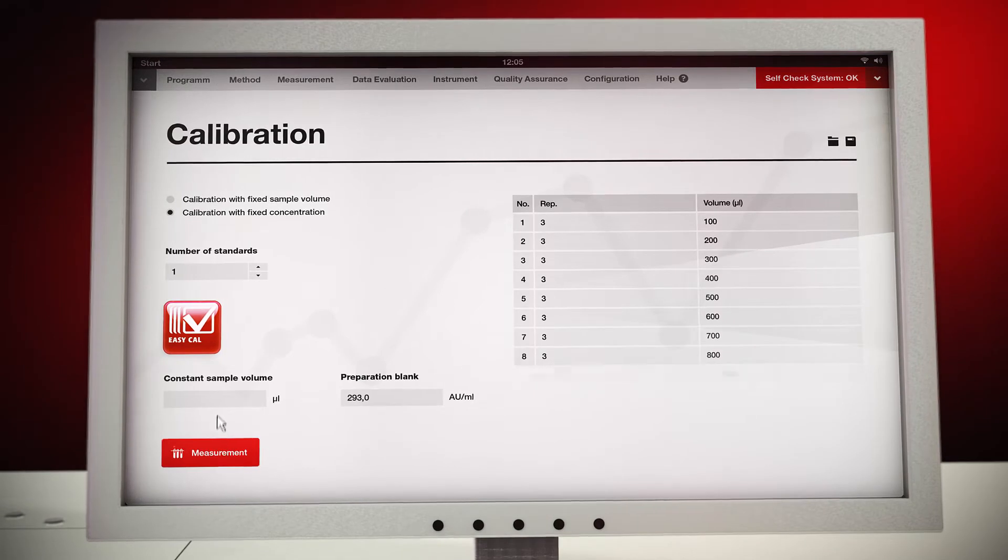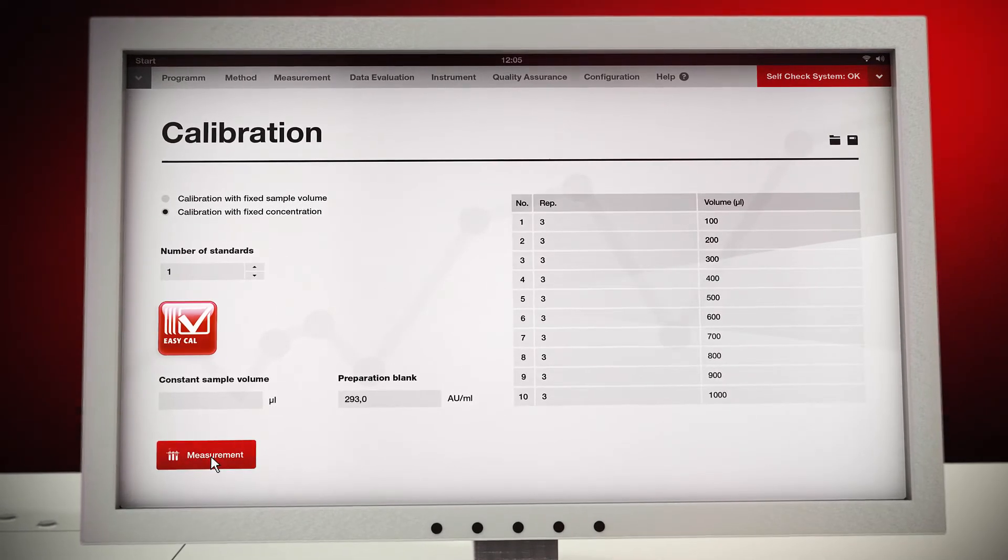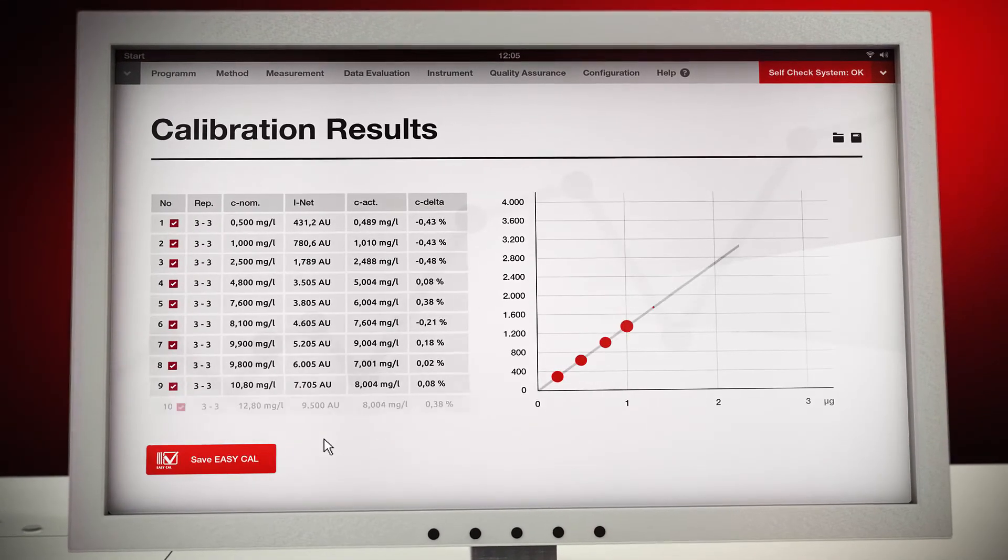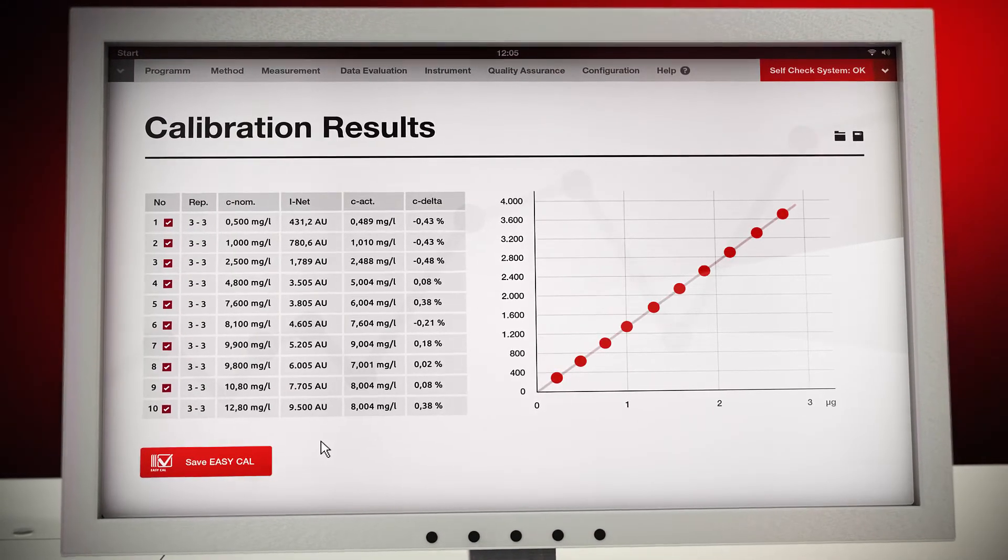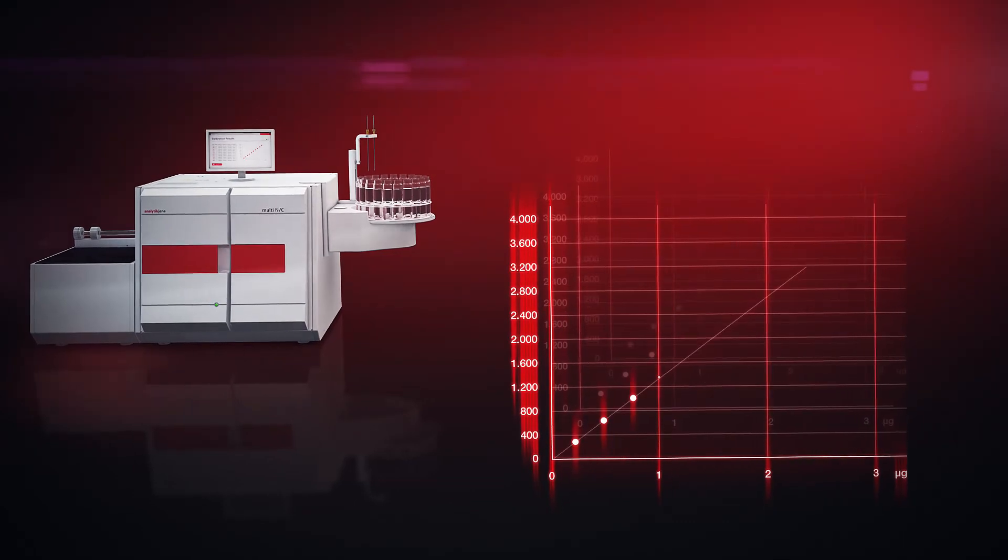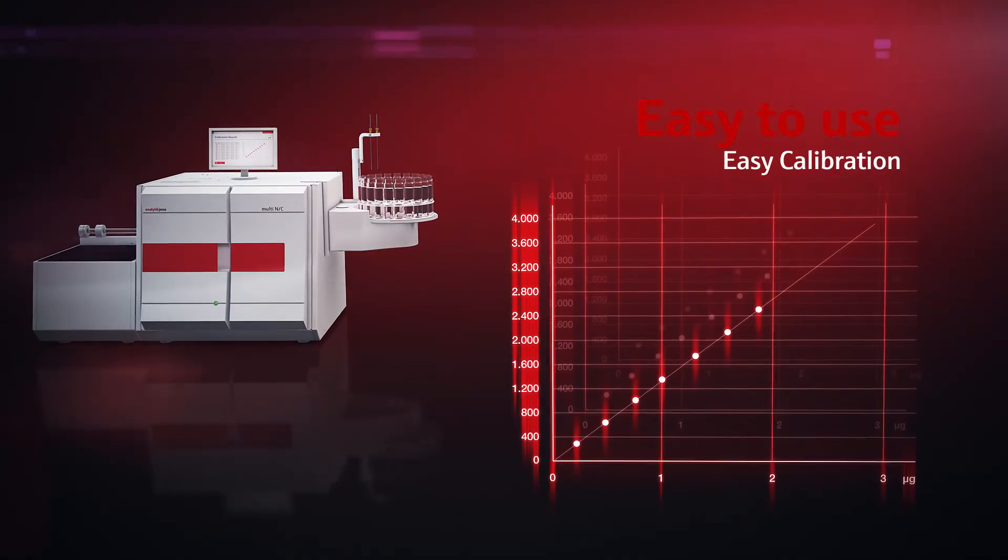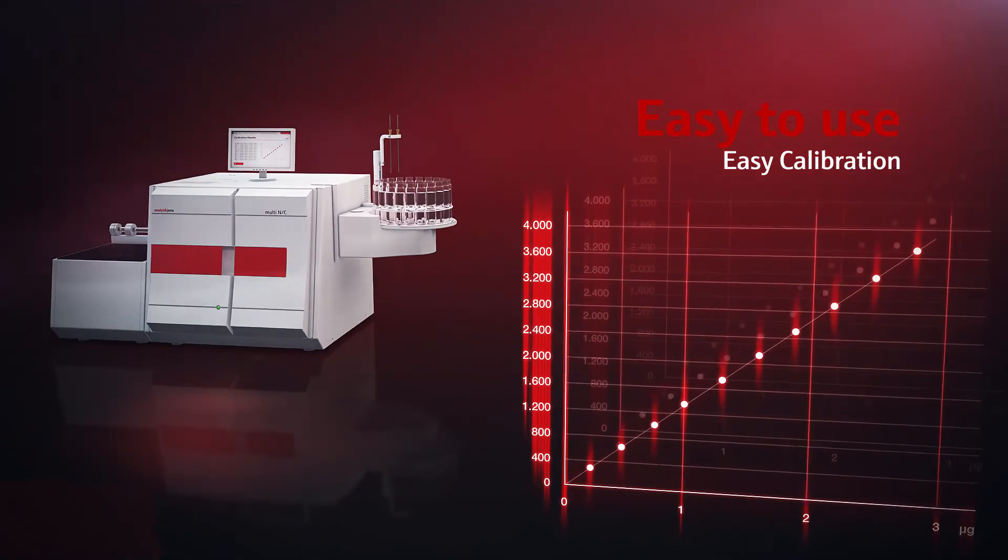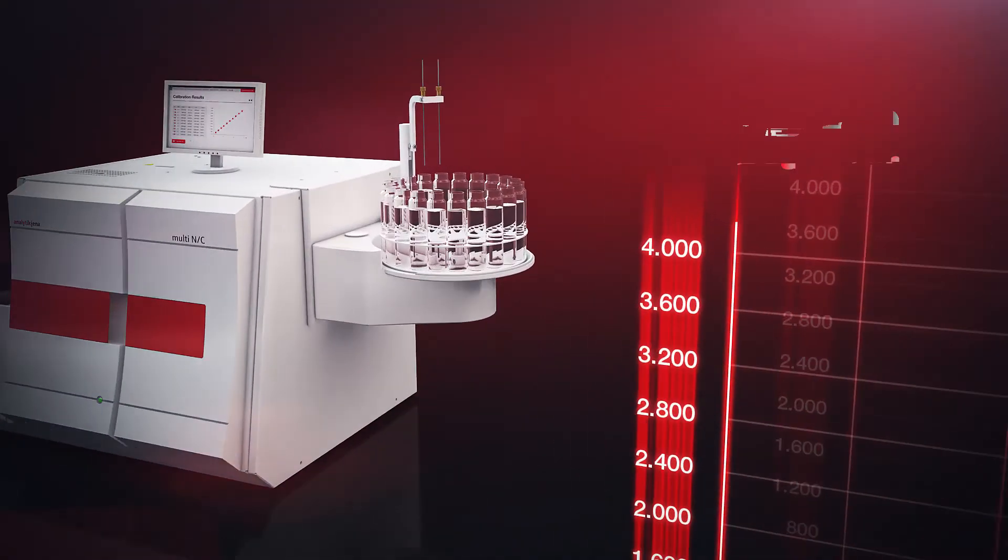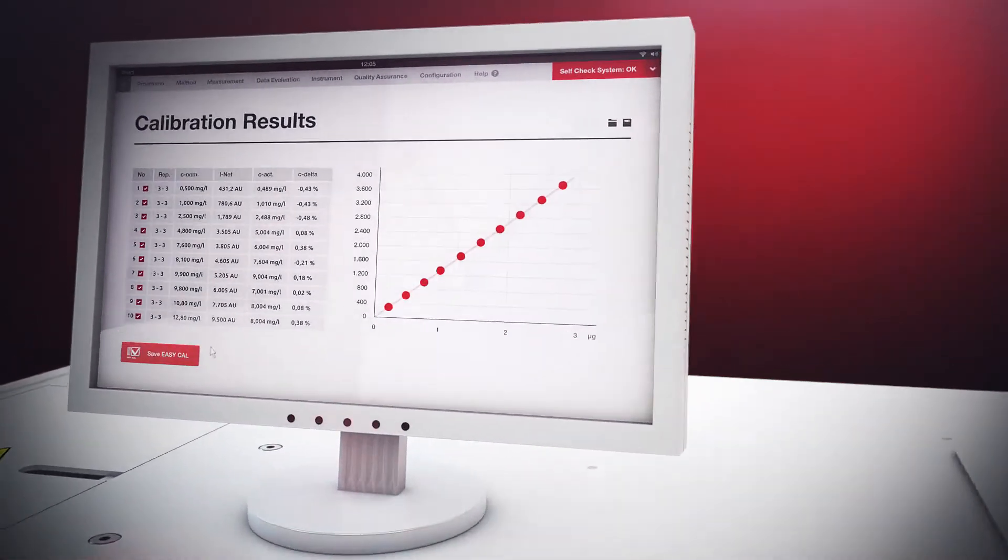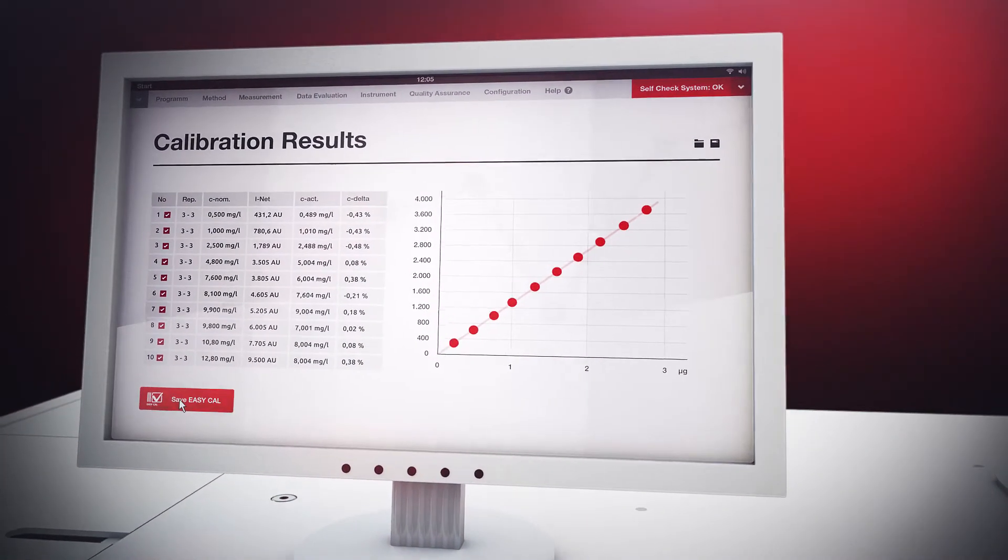EasyCal makes calibration easier than ever before. Software features like single standard multipoint calibration and automated calibration curve selection allow operating the instrument without expert knowledge.